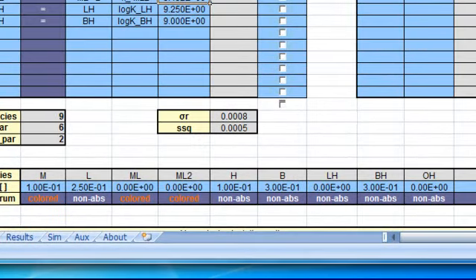During the progress of the kinetics, the protonation equilibria are always updated according to the prevailing relevant concentrations, including at time zero. The species that take part in the protonation equilibria are L, H, B, LH, BH and OH.